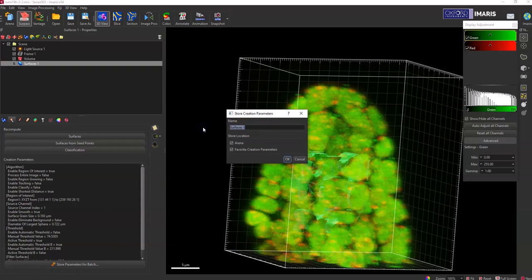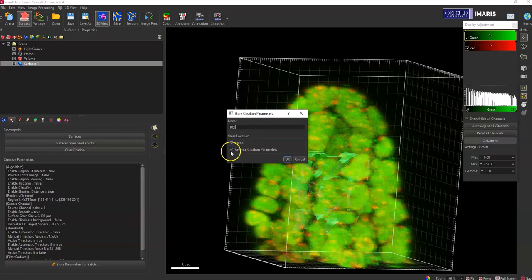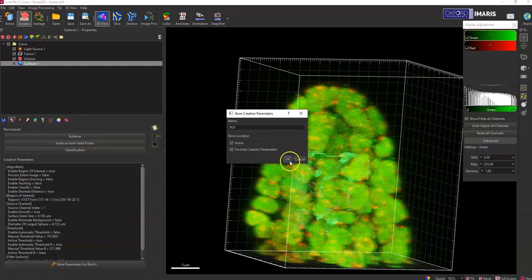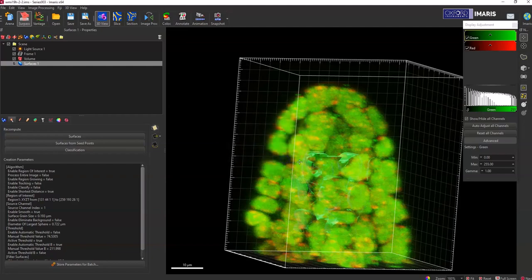Just name it something and you want to make sure you store it in the arena location. It could also be useful to save it as a favorite creation parameters too, so I would just have both those boxes checked.